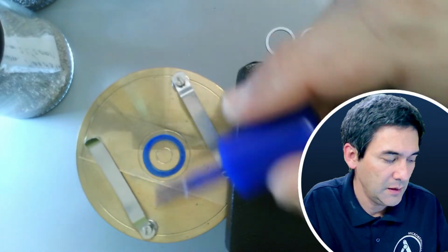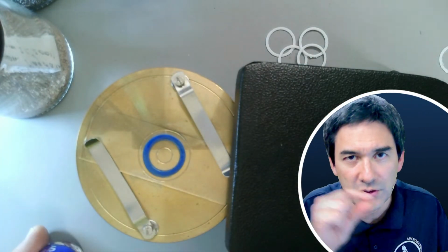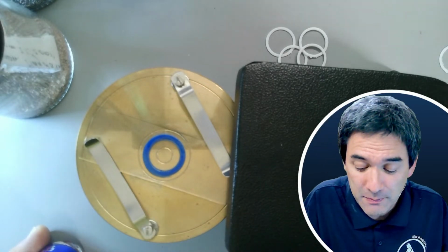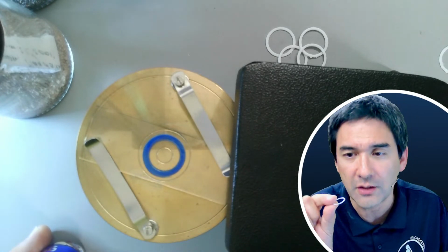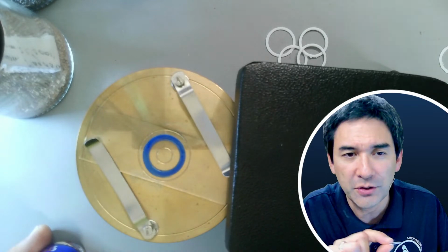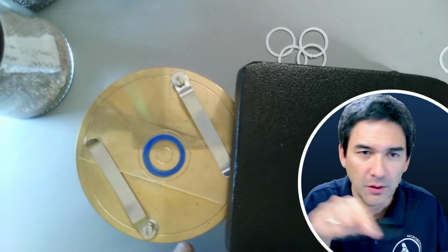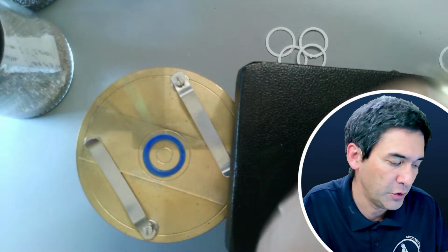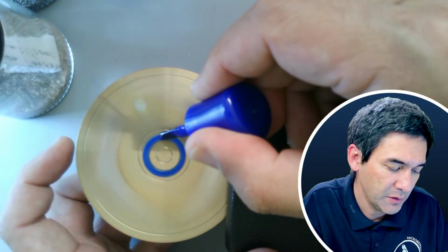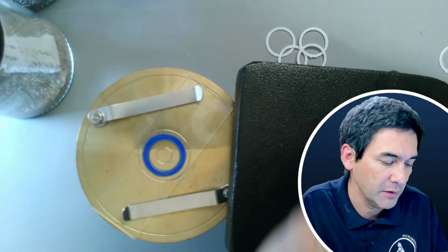And so on, okay? That's basically what I've done several times. However, I'm only able to get maybe a third of a millimeter that way. So those spacer rings really allow me to go much thicker. It really depends what you want. The difficulty with those spacer rings, however, is gluing them on the slide, because it looks a little bit ugly, with the glue or the nail polish kind of splattered around. So this is basically how it works. You simply keep on adding layer and layer and layer.